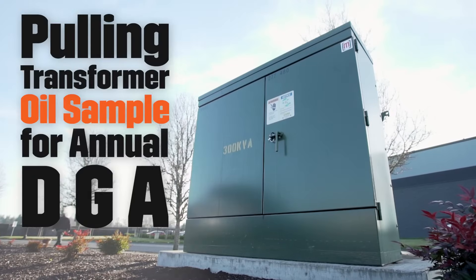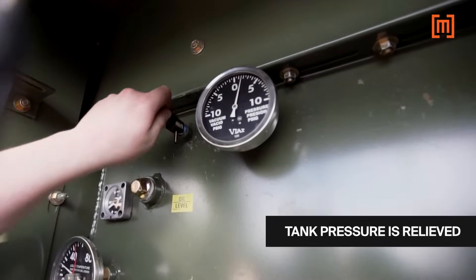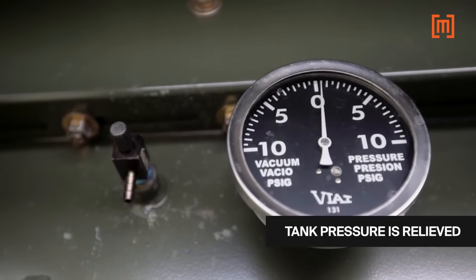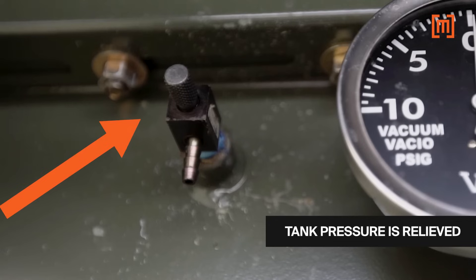This is an example of how transformer oil samples are pulled for analysis. First, the tank is relieved of pressure. Most transformers have an operating pressure of around 2 psi. Before an oil sample can be taken, the vacuum pressure gauge must read zero. The gas sample valve is opened to relieve the pressure.